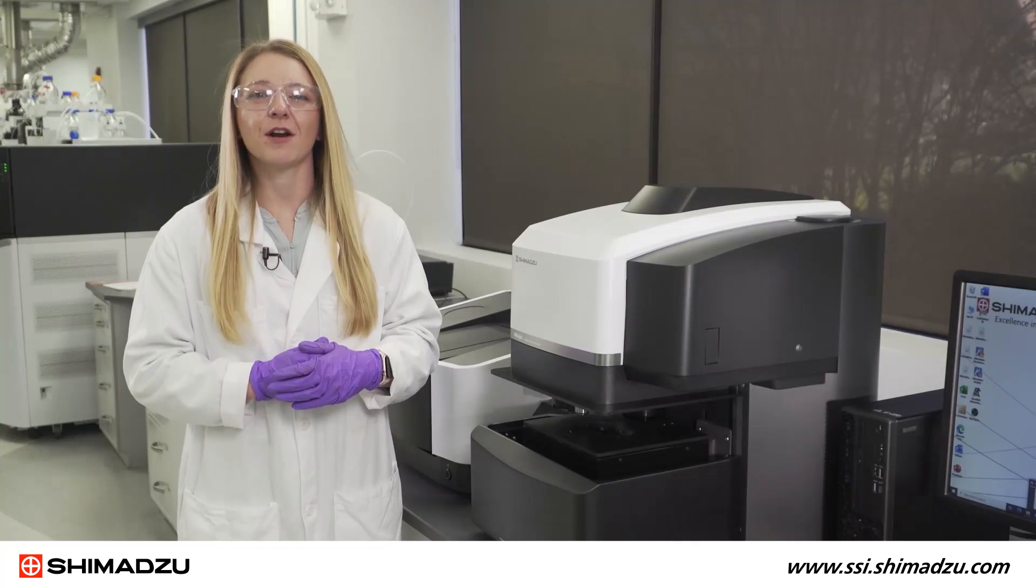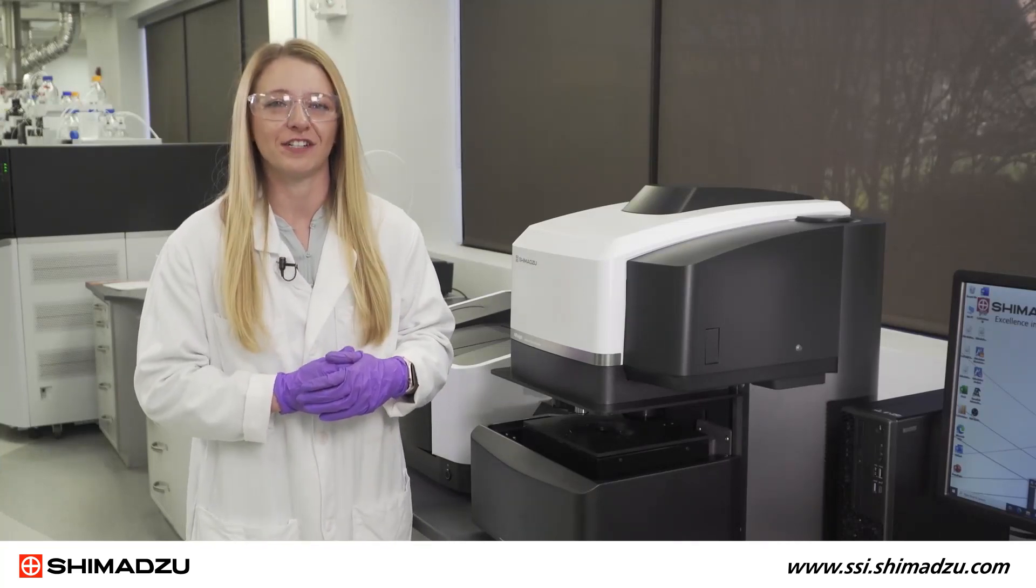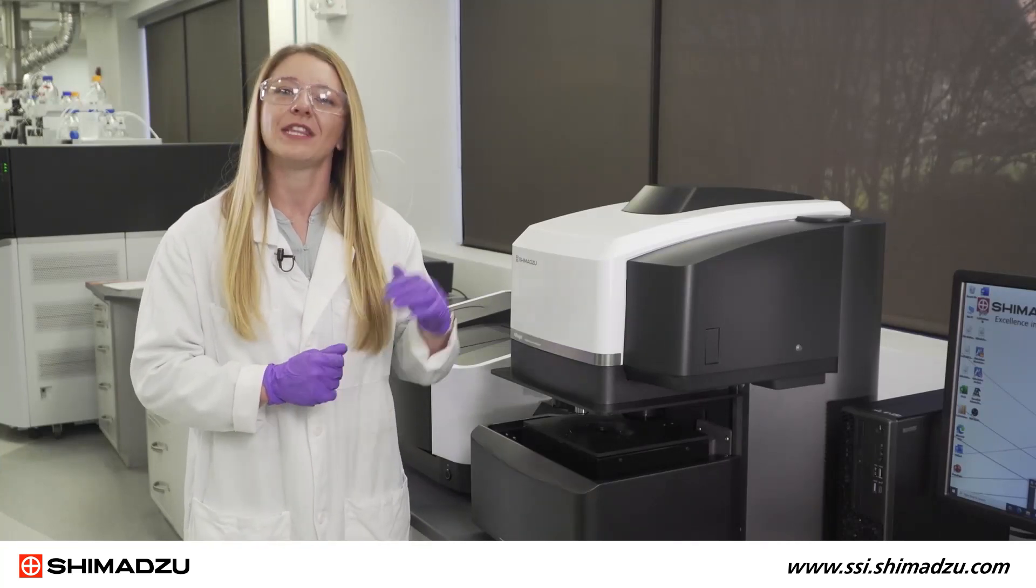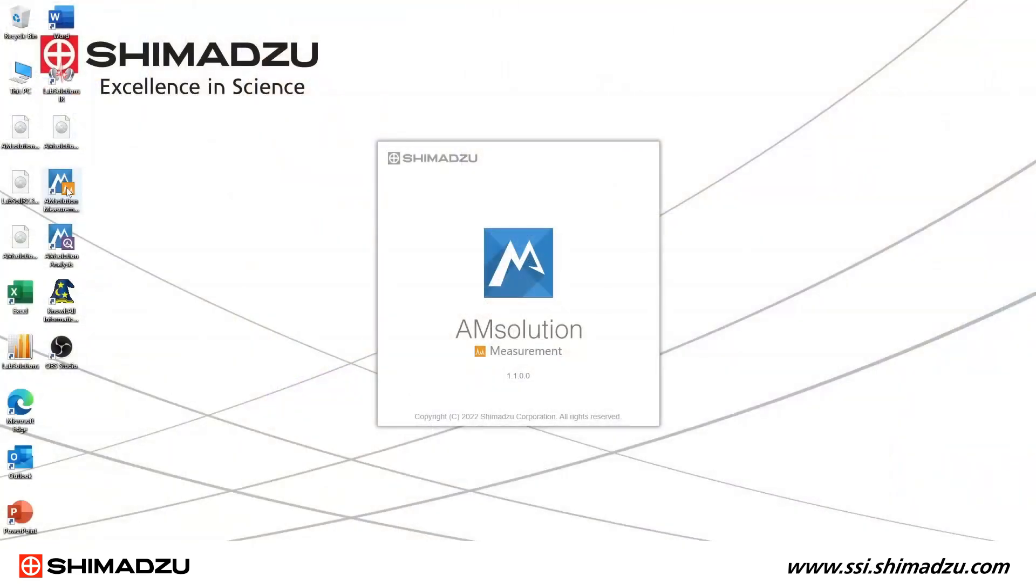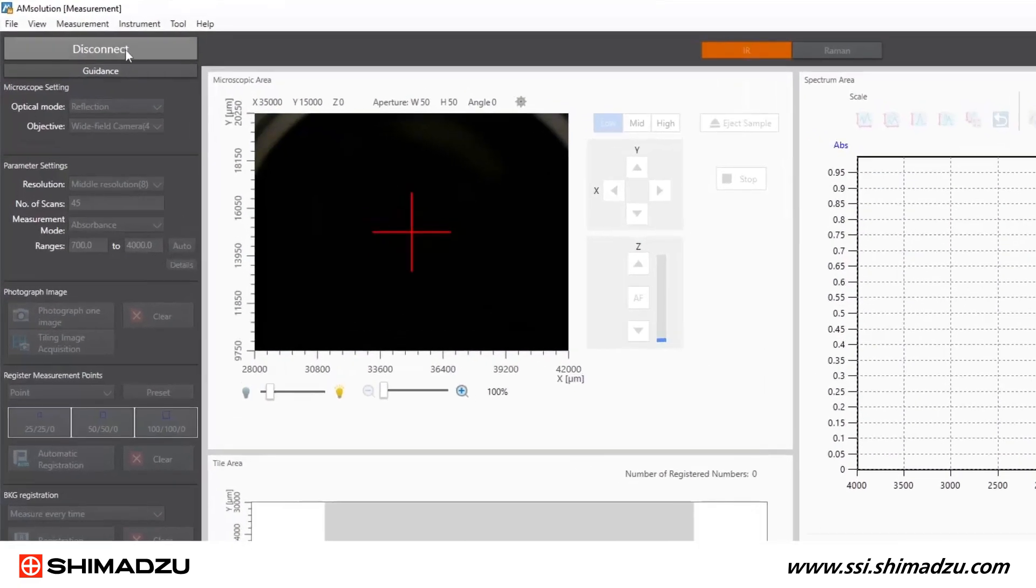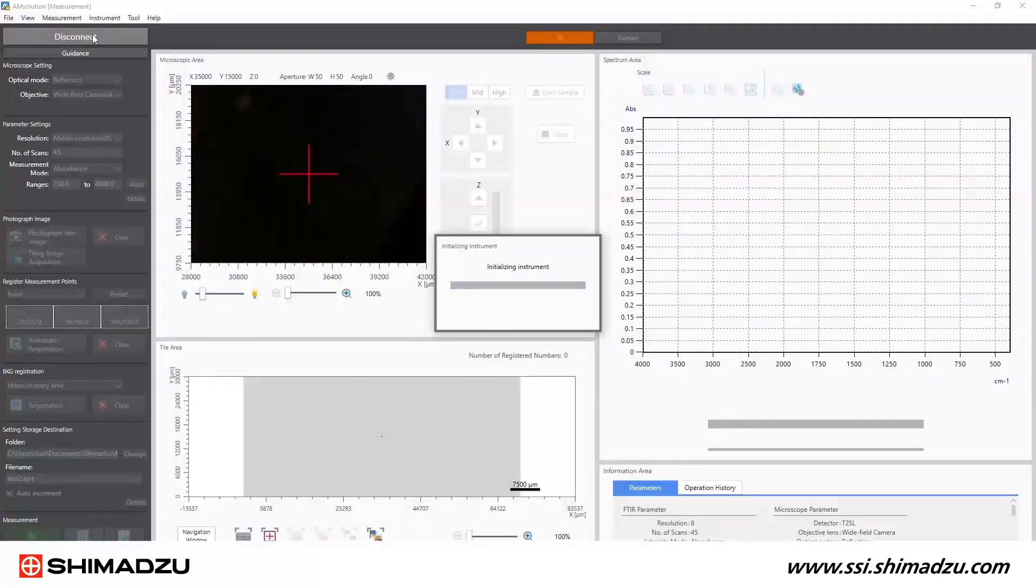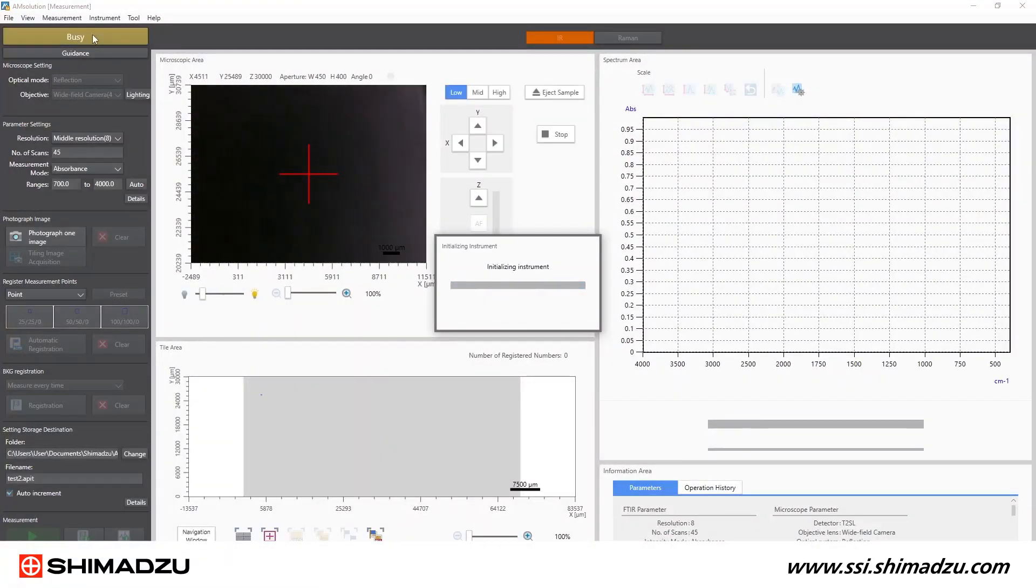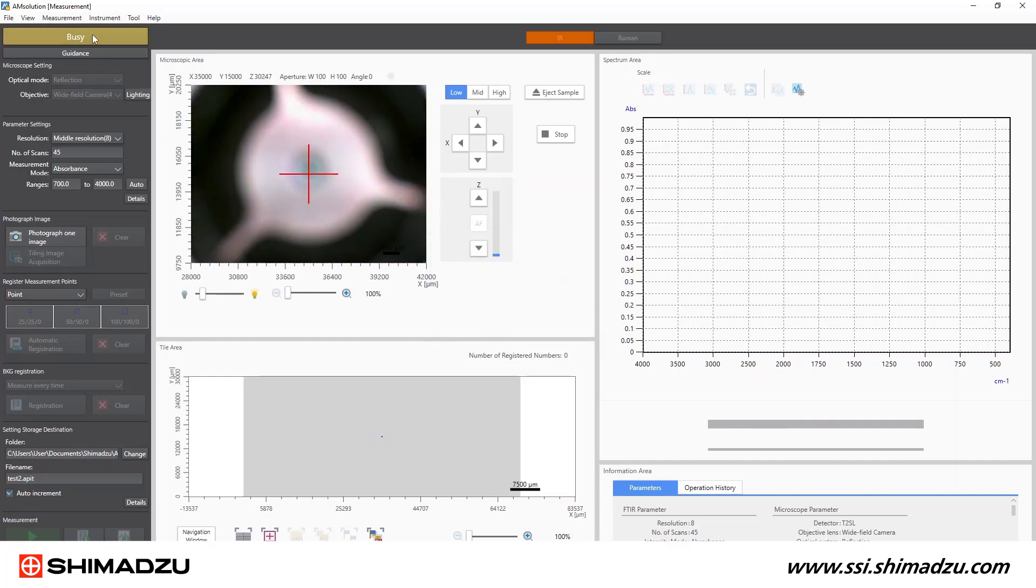Once the FTIR bench and microscope are turned on and the detector is chilled, I can open the AM solution measurement software program, first ensuring there's no sample on the stage, then connect and initialize the microscope by clicking the disconnect button. Then a ready green button notifies me that the microscope is ready to start collecting data.